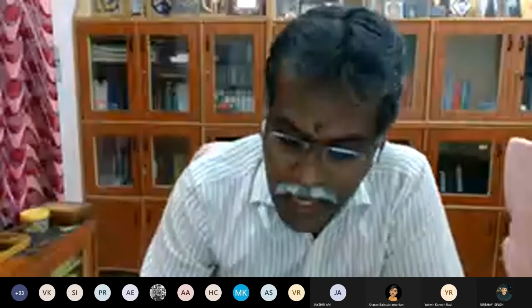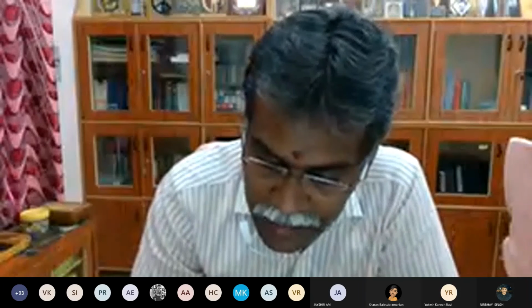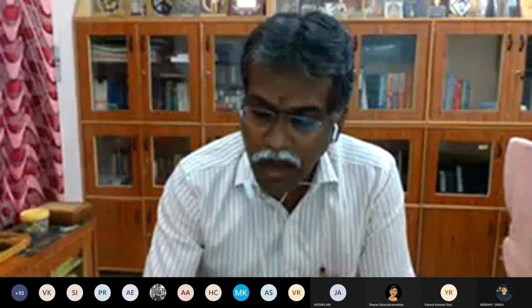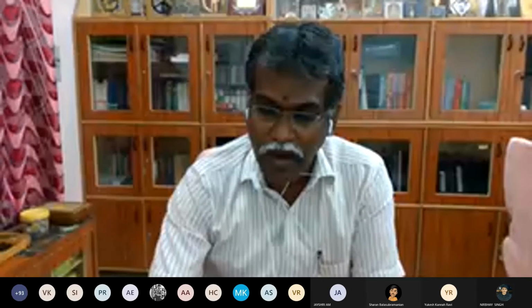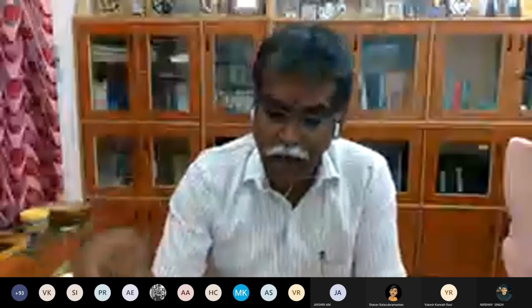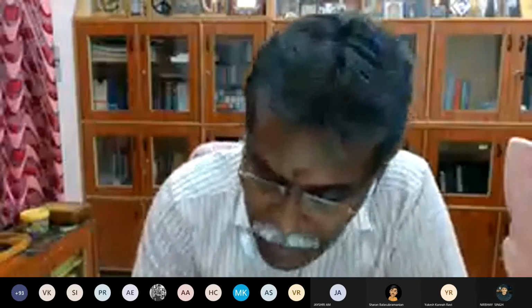You can also see two different knobs here. One knob is for your range. Please make a note. One is for your range, I told you, 40, 400 and 4000. So if you are in a position to say the approximate range of the sample, I can fix this range. Number 1. Number 2 is your calibration knob. And there are again two knobs here to set 0.